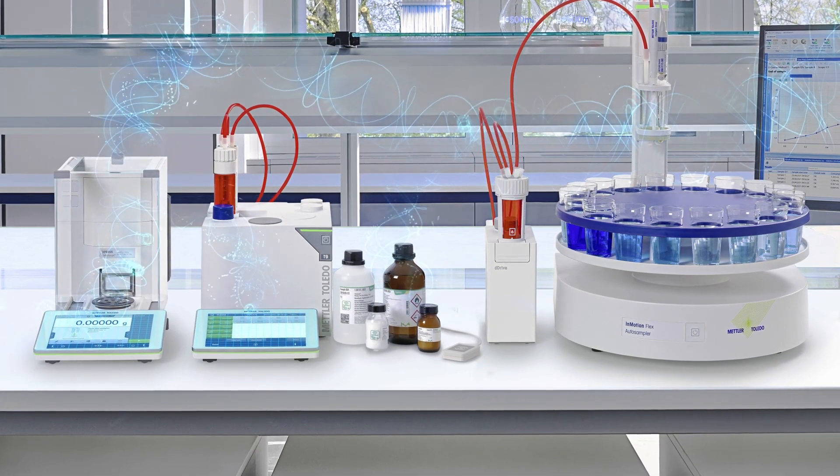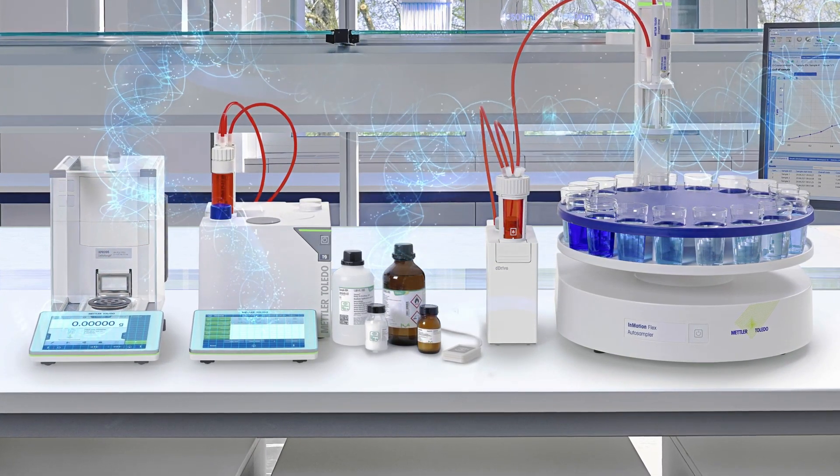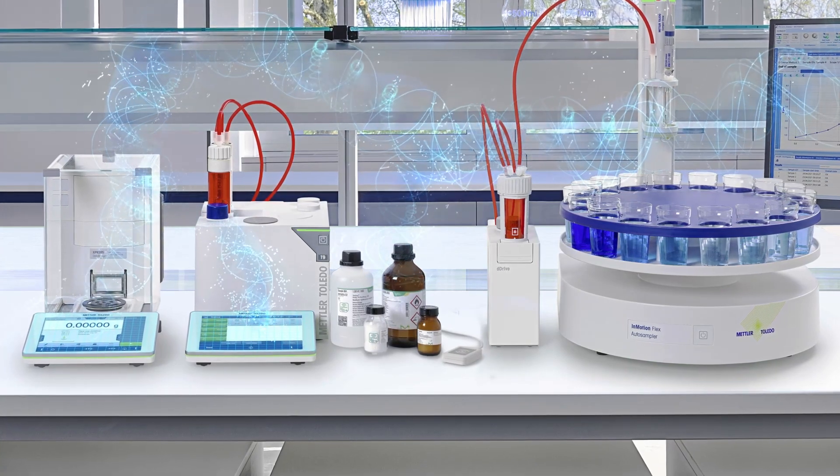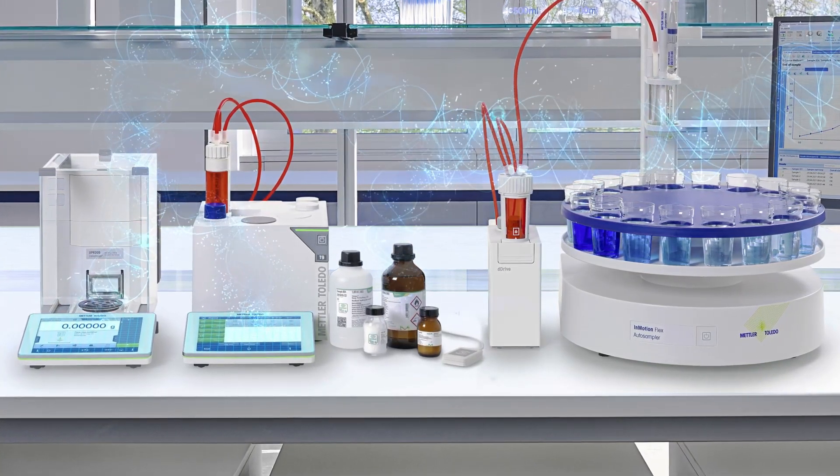Work smarter, not harder with smart titration workflows. Smart titration workflow: efficient digitalization.